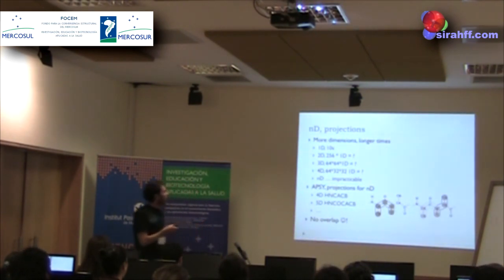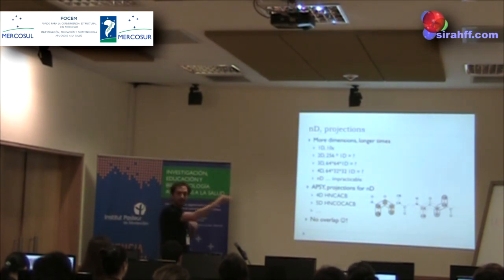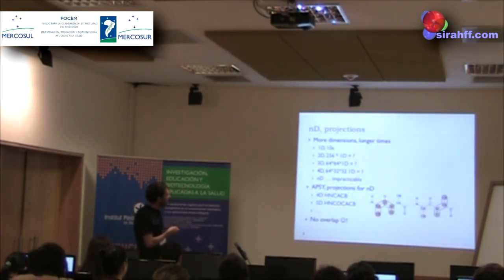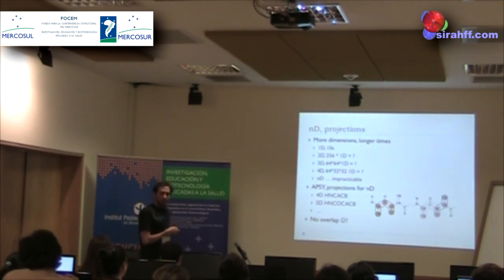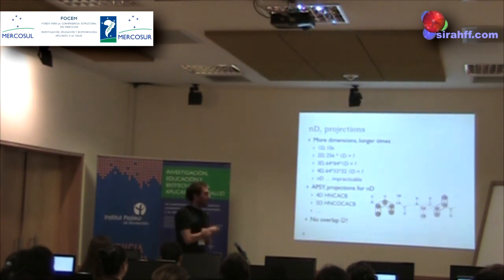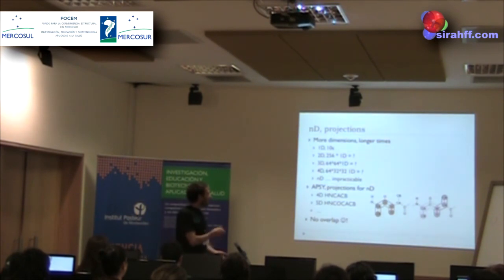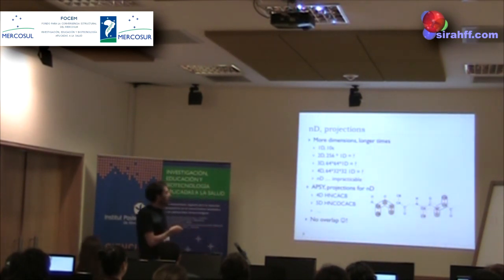For instance, to acquire one experiment, it takes maybe 5, 10 seconds. To acquire a 2D spectrum, you have to repeat this one several times. If you want to do it 256 times, this will take about 20 minutes. For a 3D spectrum, you have to repeat the 2D spectra several times, and this might take a few hours, 3, 4, 10 hours. For a 4D spectrum, you have to repeat several 3D spectra, and 4D spectra take days.